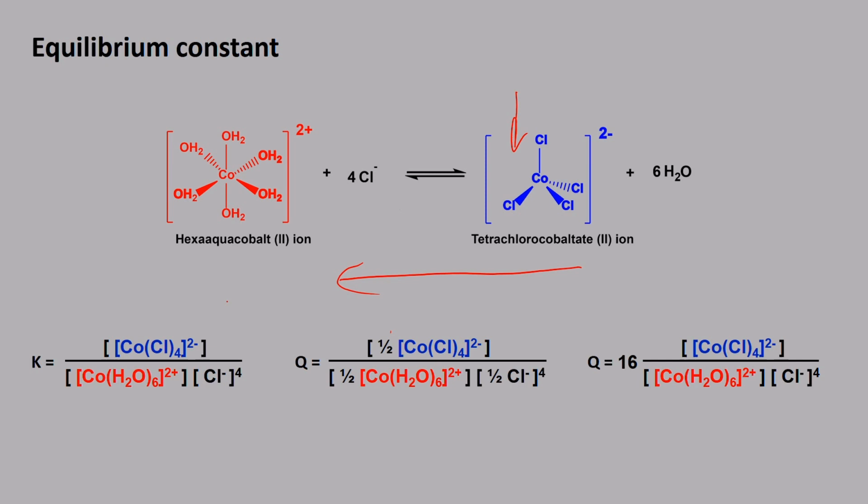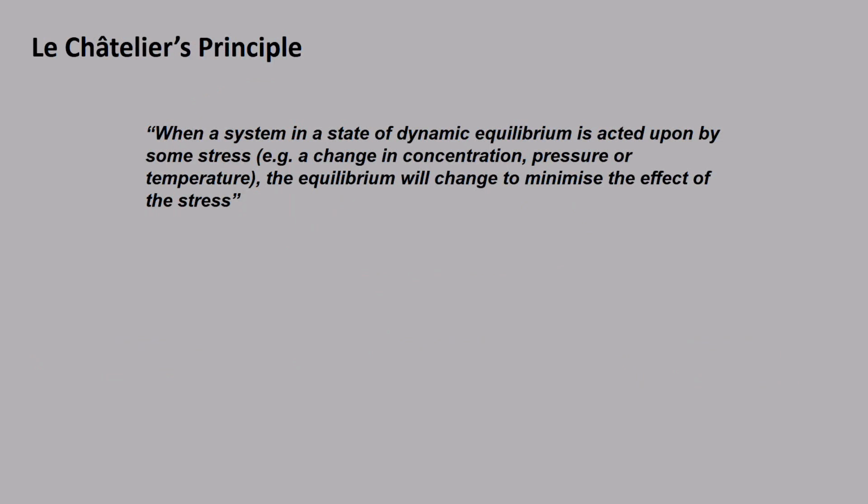So our blue color will dissipate and we will get more of a red color.